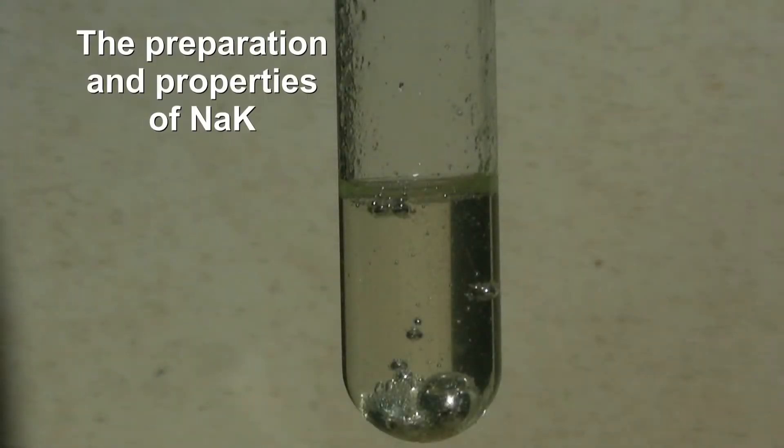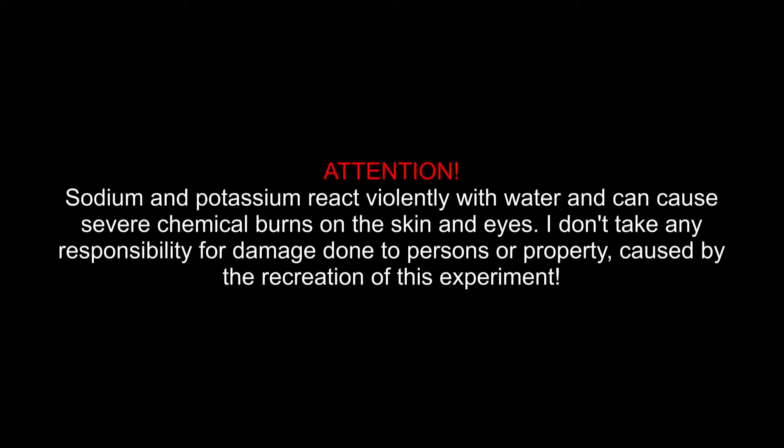The preparation and properties of NaK. Attention! Sodium and potassium react violently with water and can cause severe chemical burns on the skin and eyes. I don't take any responsibility for damage done to persons or property caused by the recreation of this experiment.